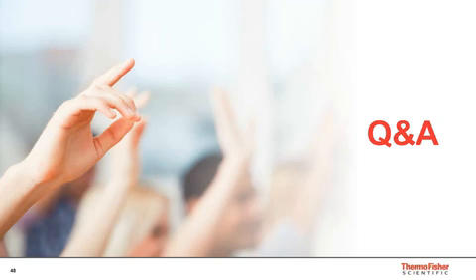Wonderful, thank you. We have one more question coming in from our audience member. Which MS instruments can be used to analyze the TMT11 samples?